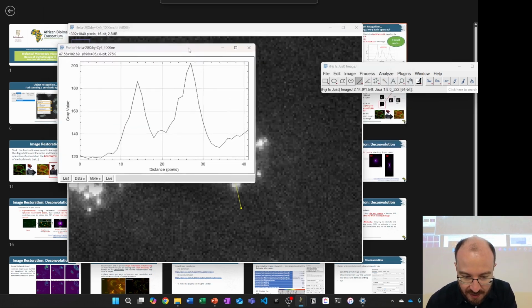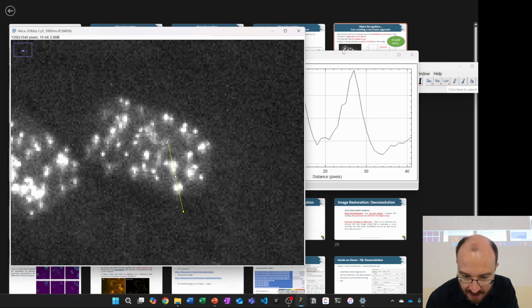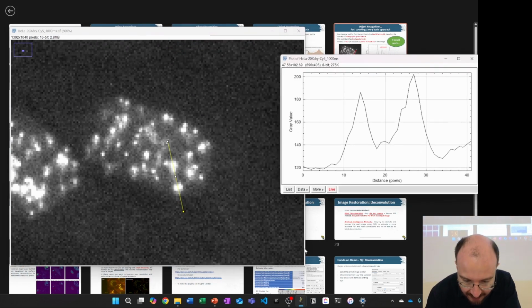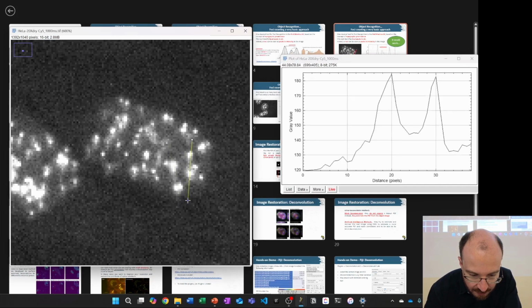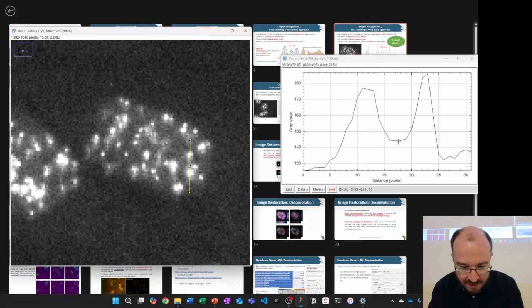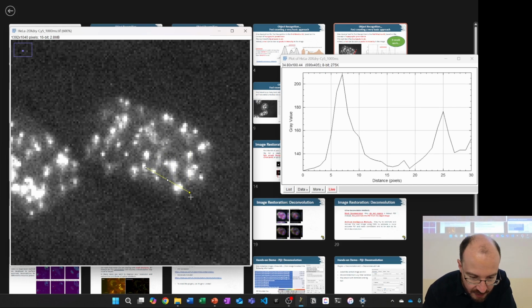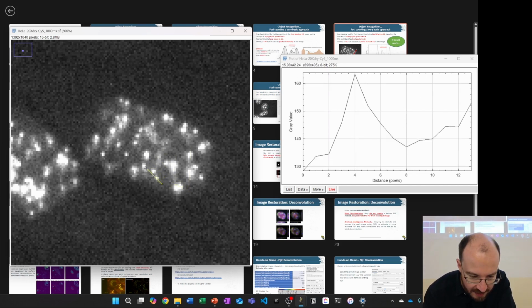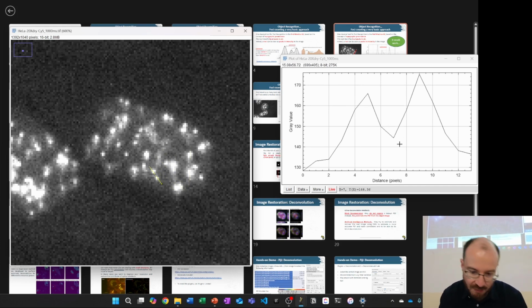Let's see if I look at some other area. Okay, now shift this around. If I get both on the same screen, and I move this line around to, for example, that one, it's a little less clear there. It goes down from about 175 to about 145, so that's about 30. But I might even want something a bit more subtle, where I want these to be counted as two separate ones. That drops from about 165 to about 145, so it's about 20.